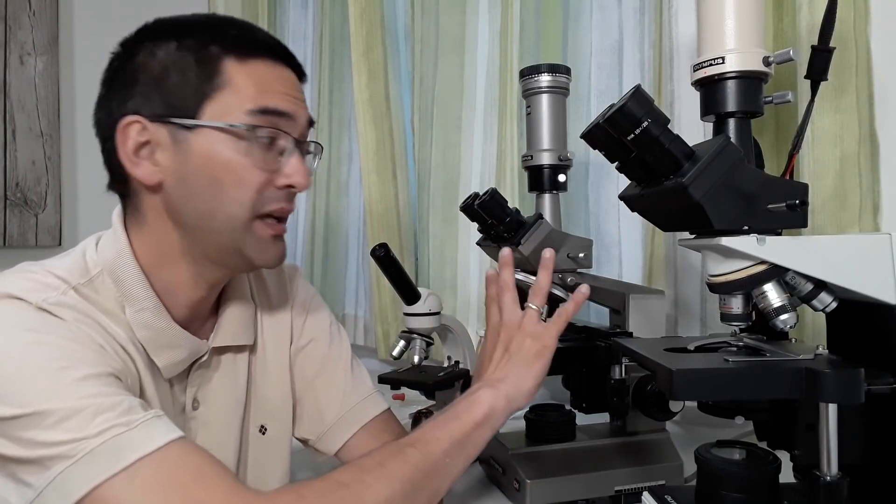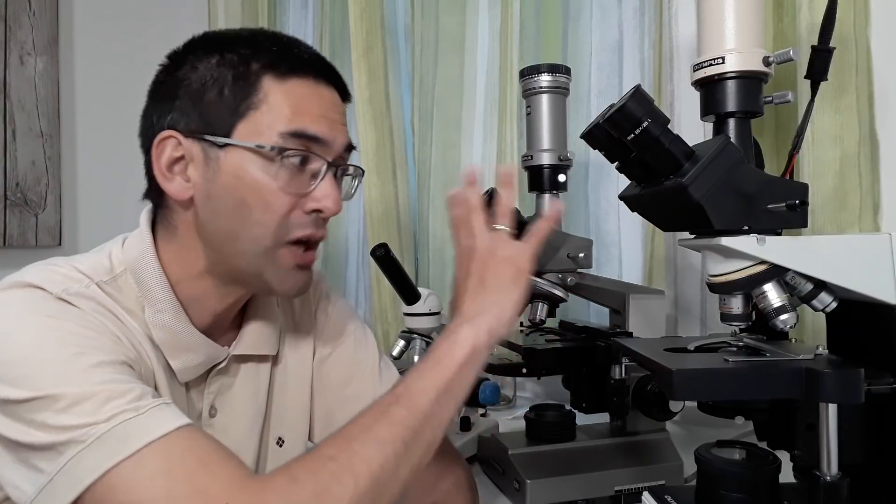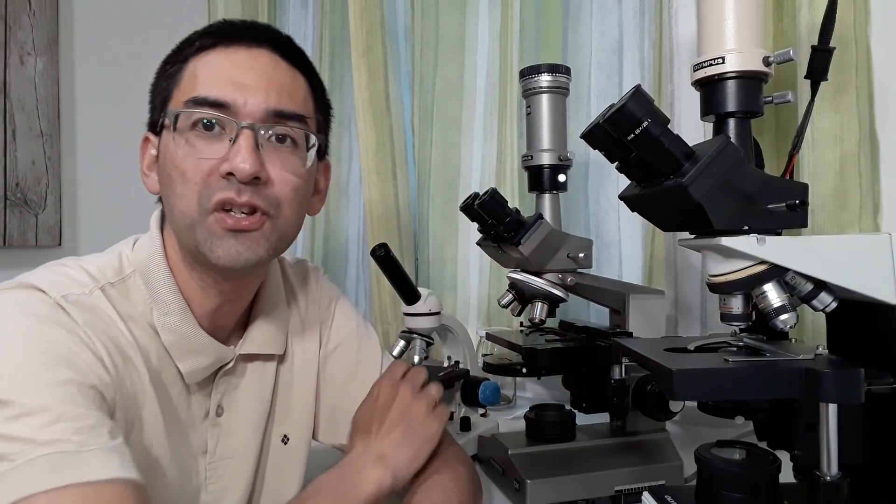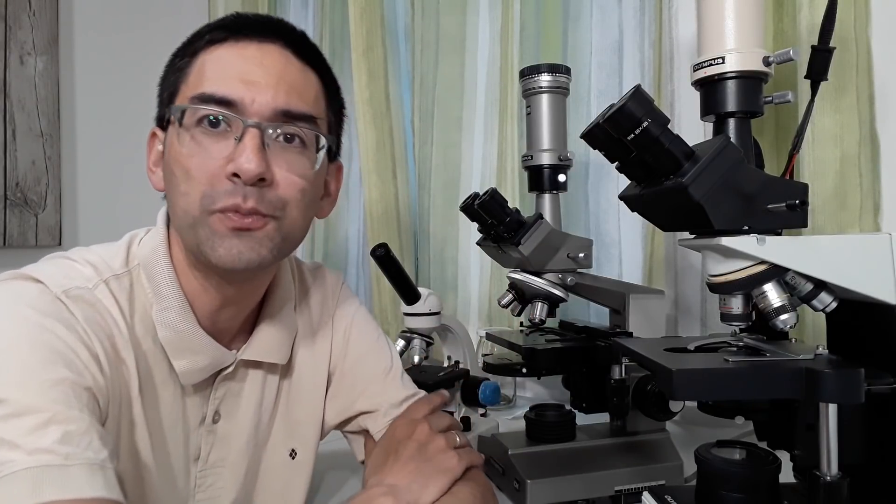Phase contrast is a little bit cheaper, but also not so easy to get. You have to either buy this equipment secondhand, like I did here. That's a phase contrast microscope, which I assembled together from used parts that are bought over eBay. So the price was reasonable. But if you want to buy this new, you're also, it's also going to be quite costly and you have to talk to brand microscope manufacturers who offer these microscopes. Generally, you will not find this in the low end educational sector.